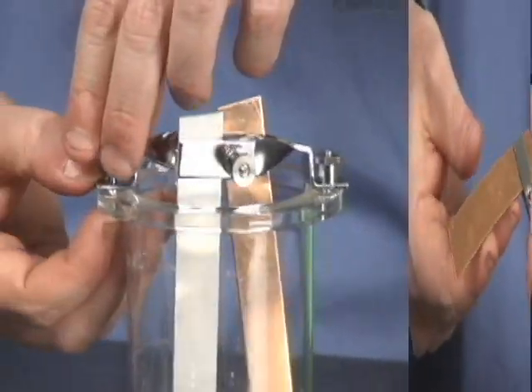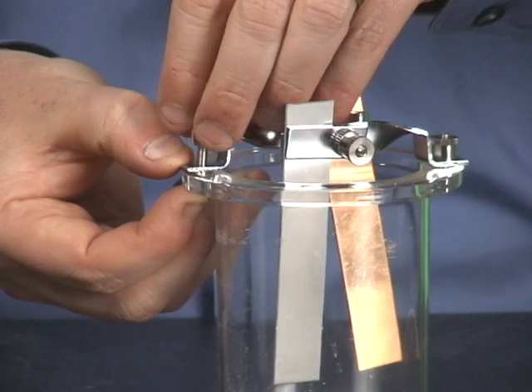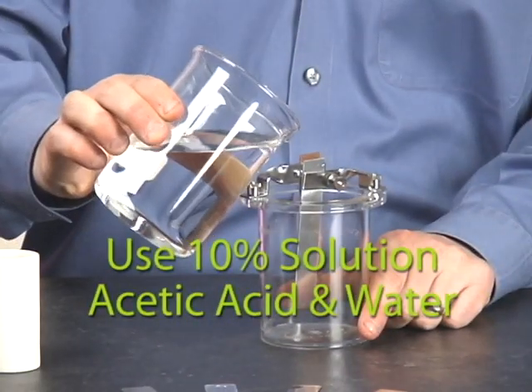Attach zinc and copper electrodes to the clamps on the cup, then fill the cup with an electrolyte such as acetic acid.